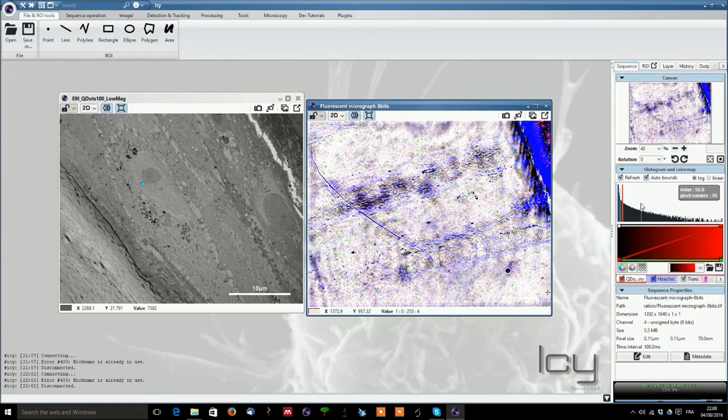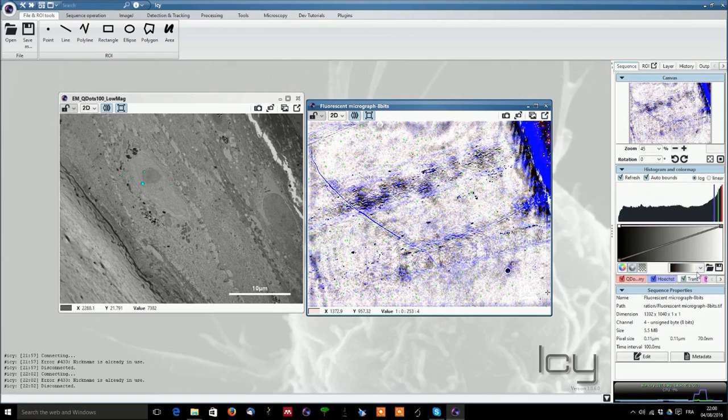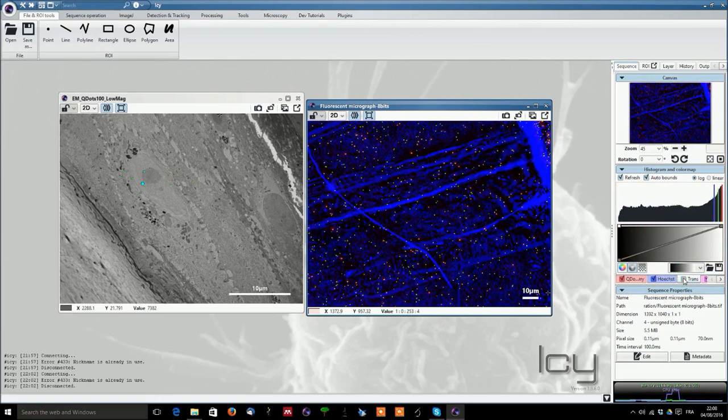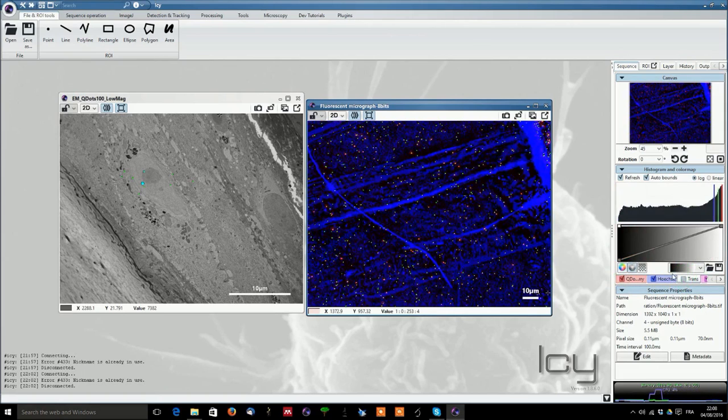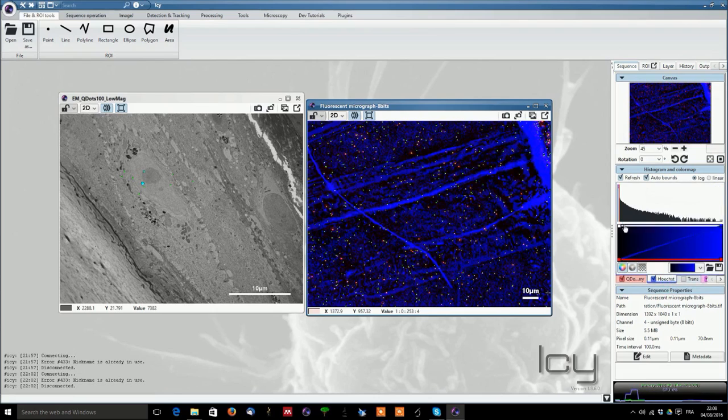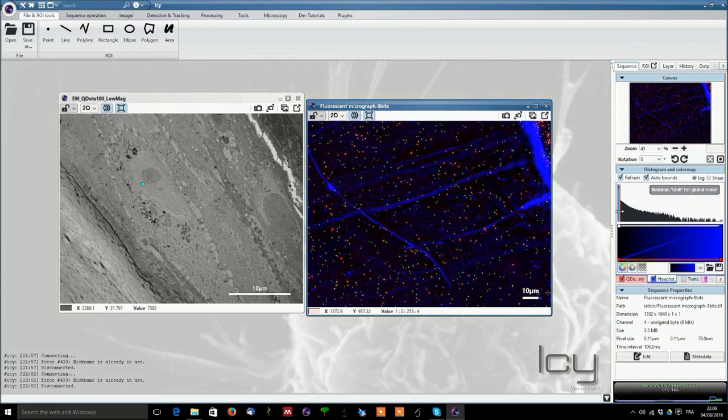Then you can also play with the histogram so you select this one, you can switch it on and off and you can adjust the histogram as you wish. Then you can also go to the transmitted light here and you can switch it on and off as you wish.